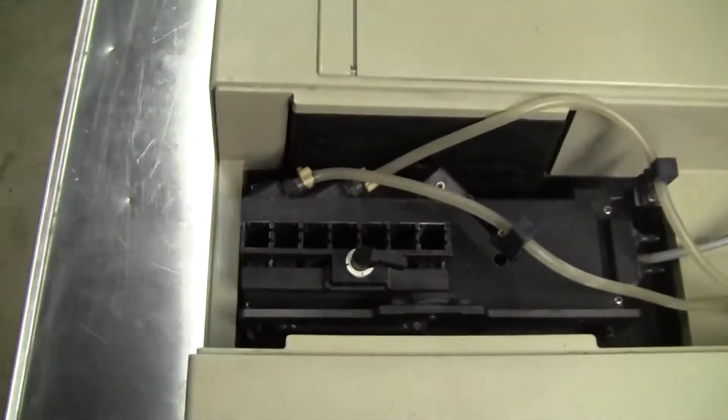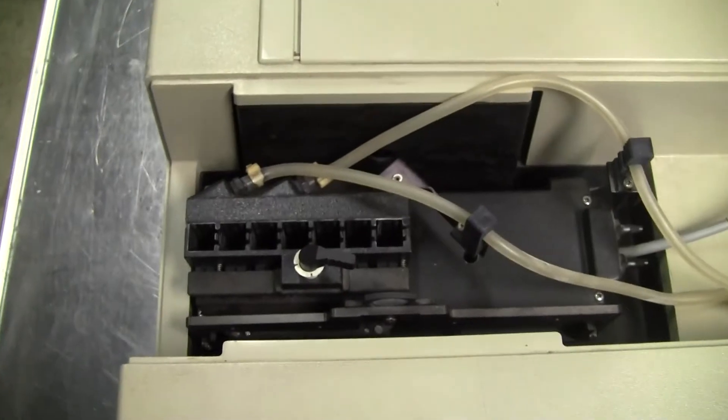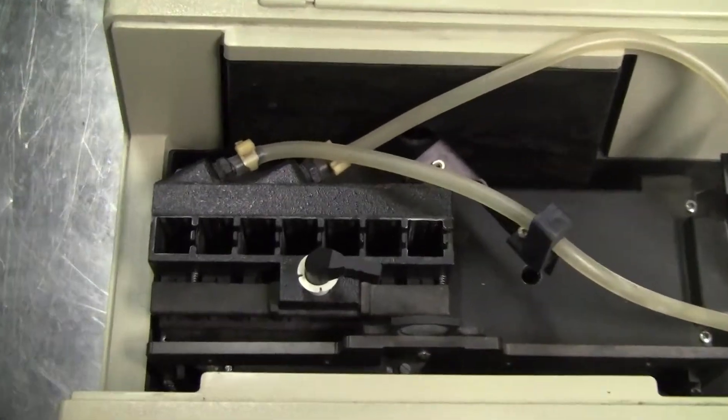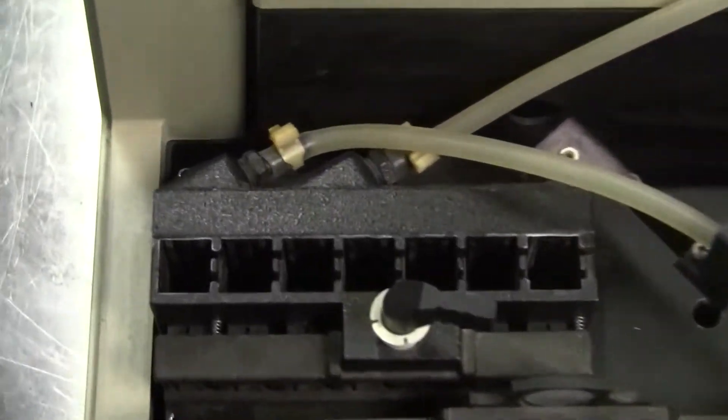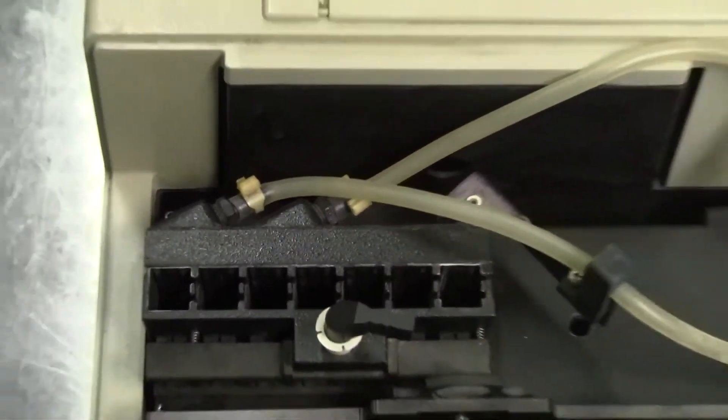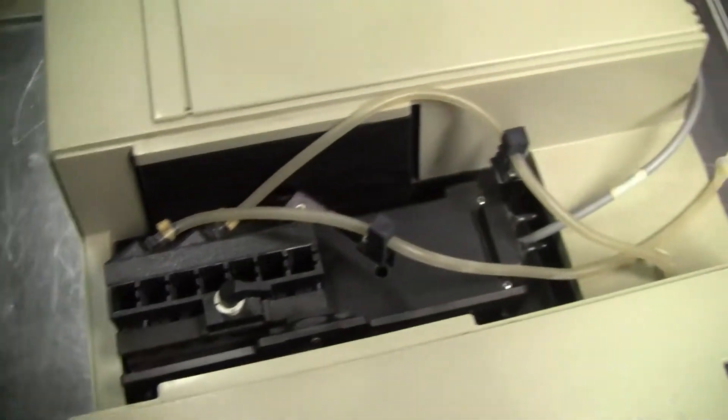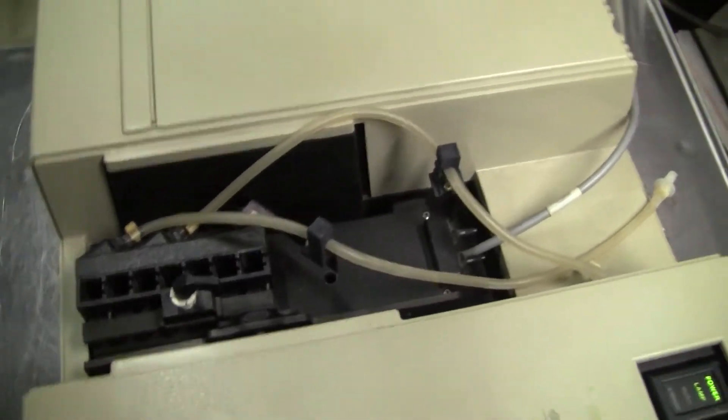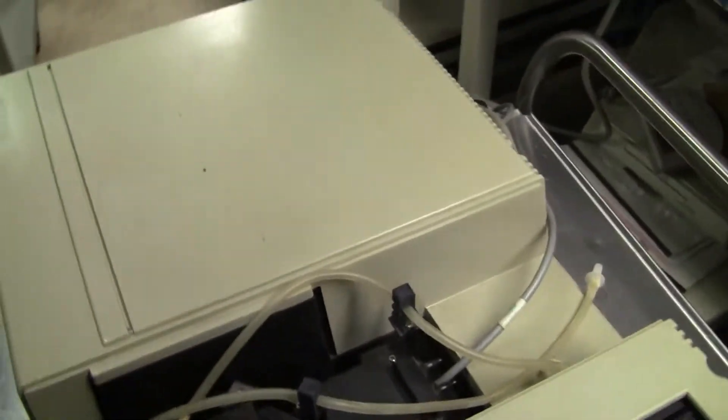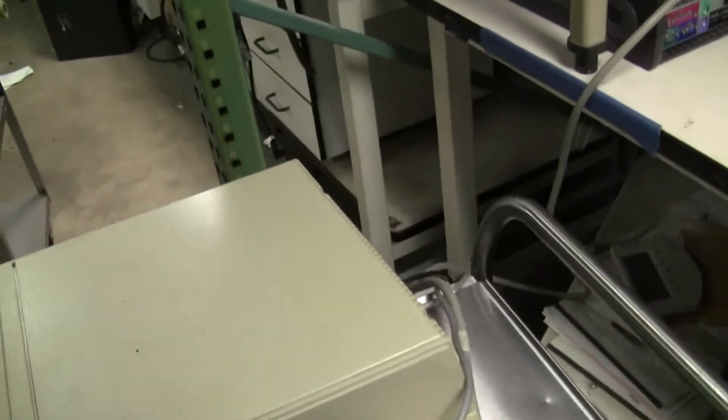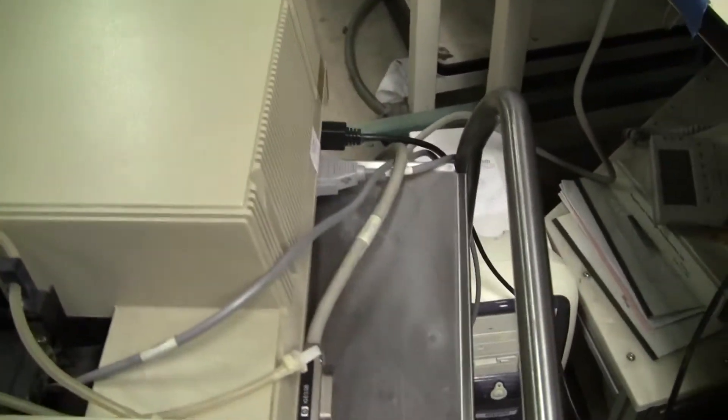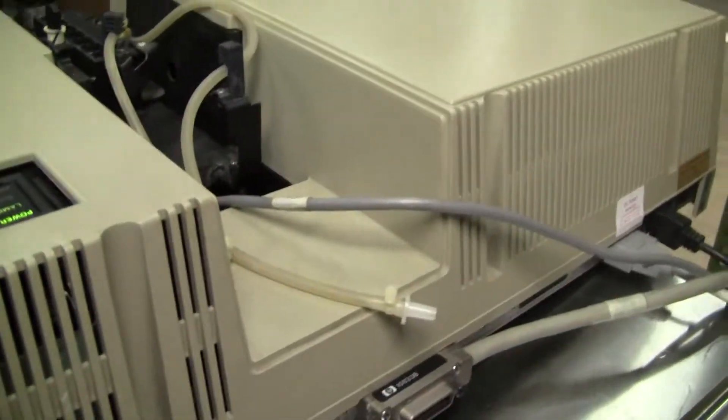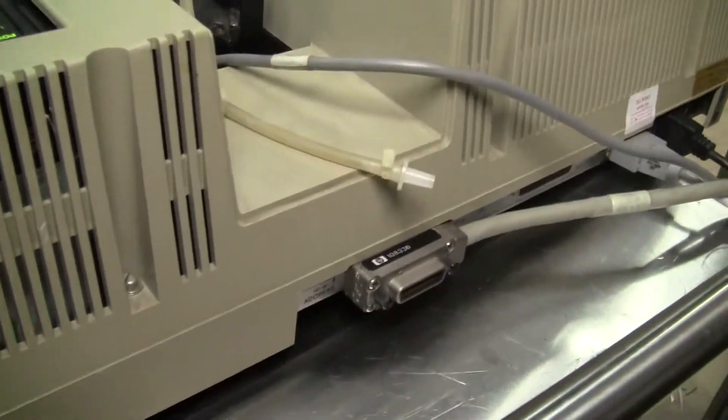It's a multi-cell holder with cooling. Runs off of HP-IB or GP-IB cables and cards into a computer. We're using ChemStation software.